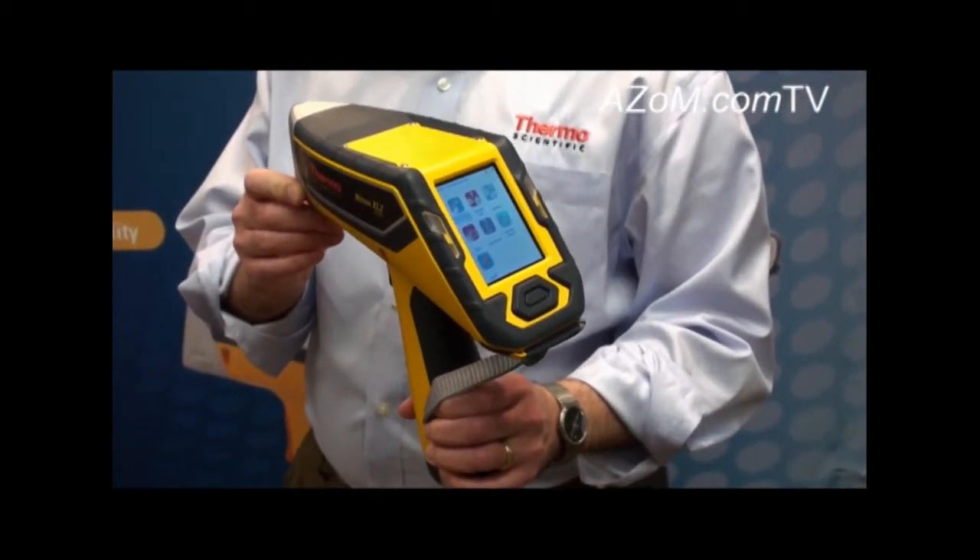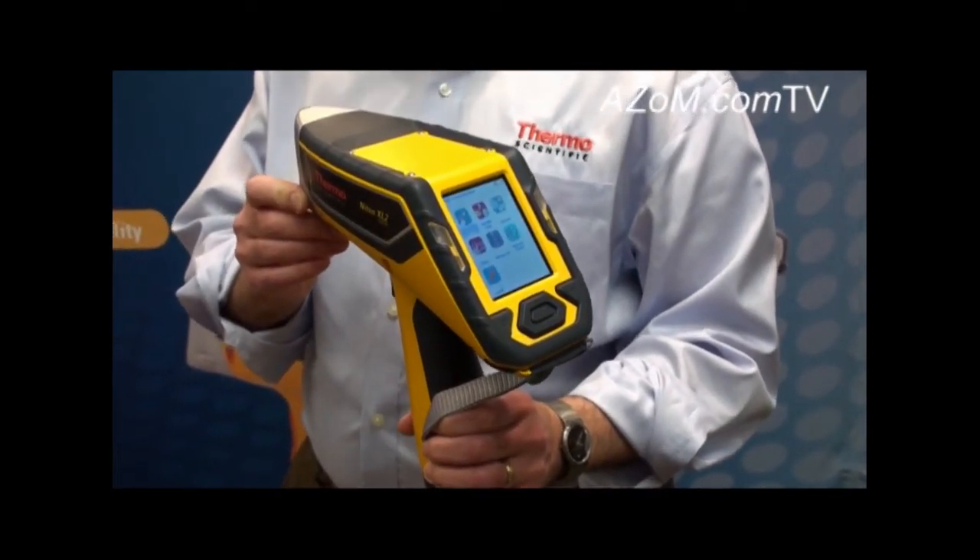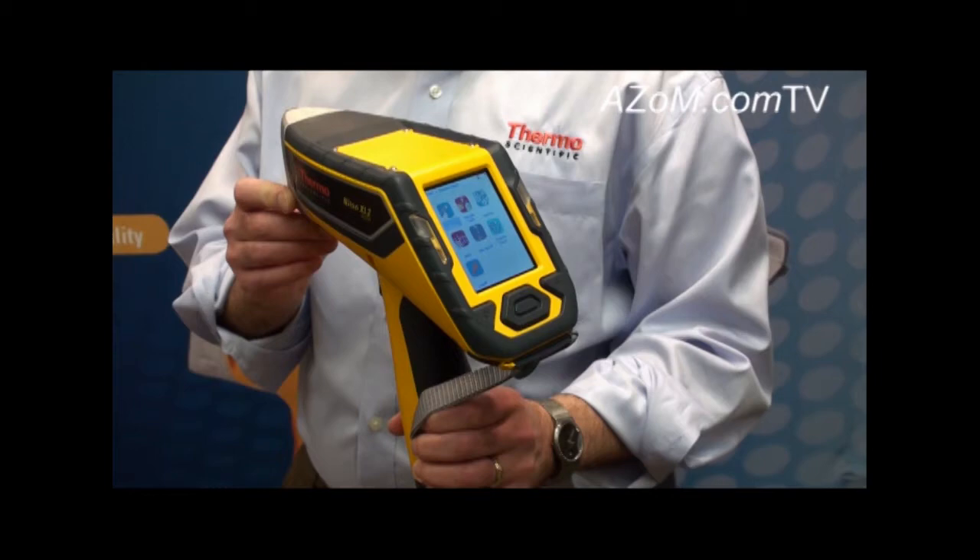GOLD technology also gives users the ability to measure samples in shorter amounts of time with greater precision than was previously available with other technology.